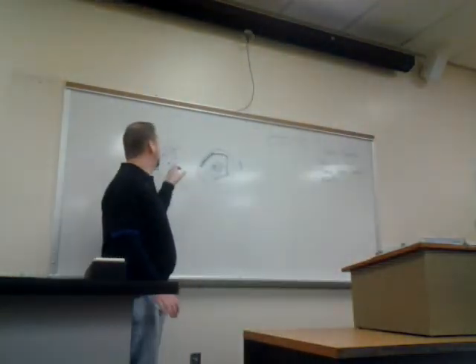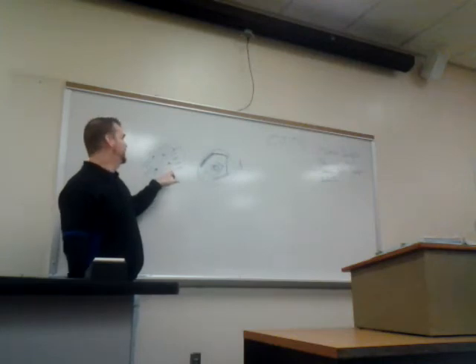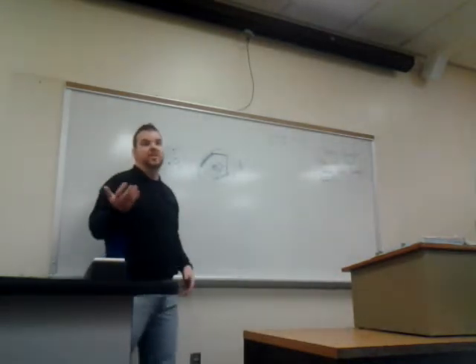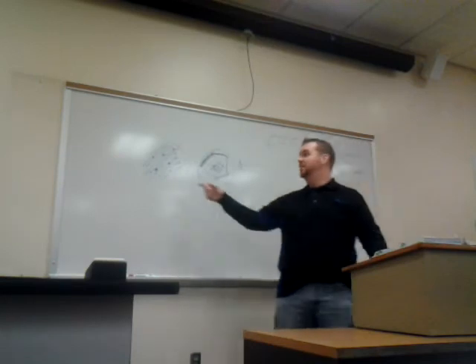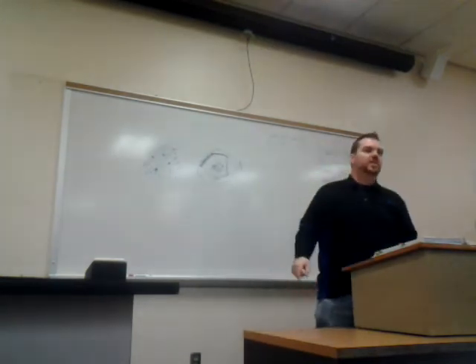So this would be a very effective antibiotic against it. This would be semi-effective. So if someone's allergic to this one, you could use this one, but this one wouldn't be any good. You could give it to anyone and it wouldn't kill the bacteria, it wouldn't do any good. So you're just wasting your time. So they can narrow down certain antibiotics for certain diseases depending on these tests. Okay?